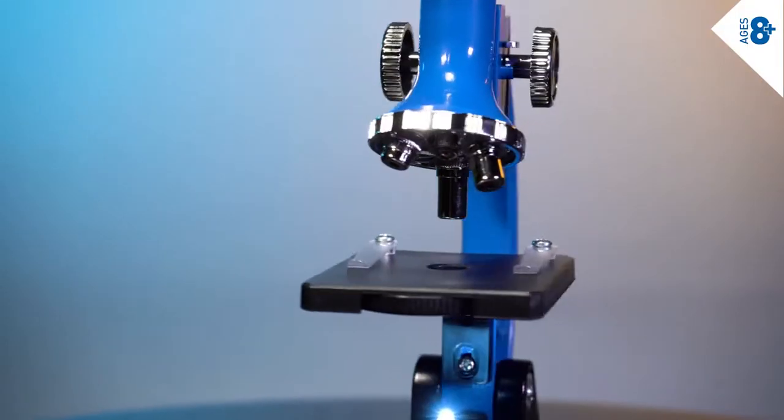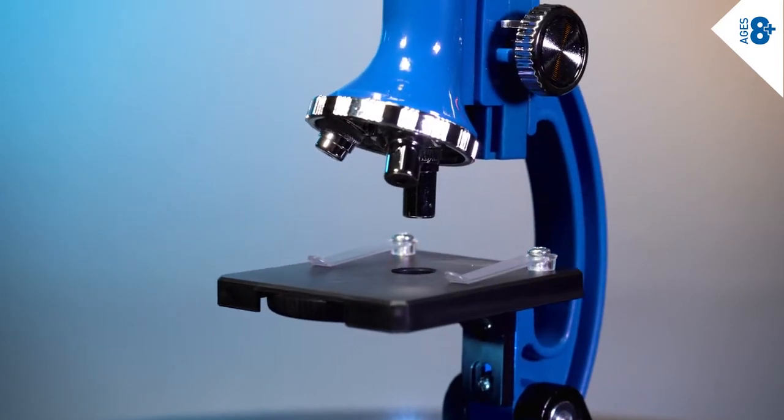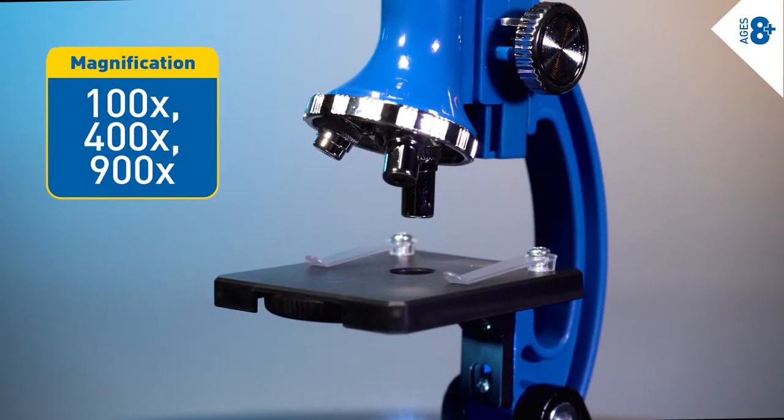Three objective lenses mounted on a rotating turret provide magnifications of 100, 400, and 900 times.